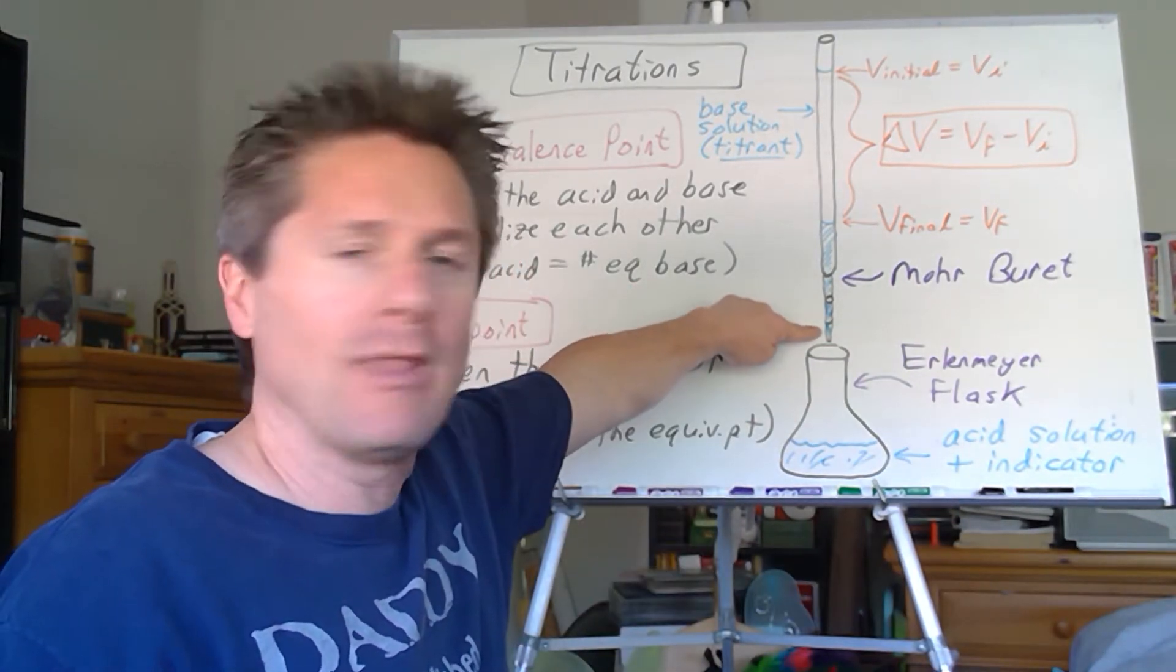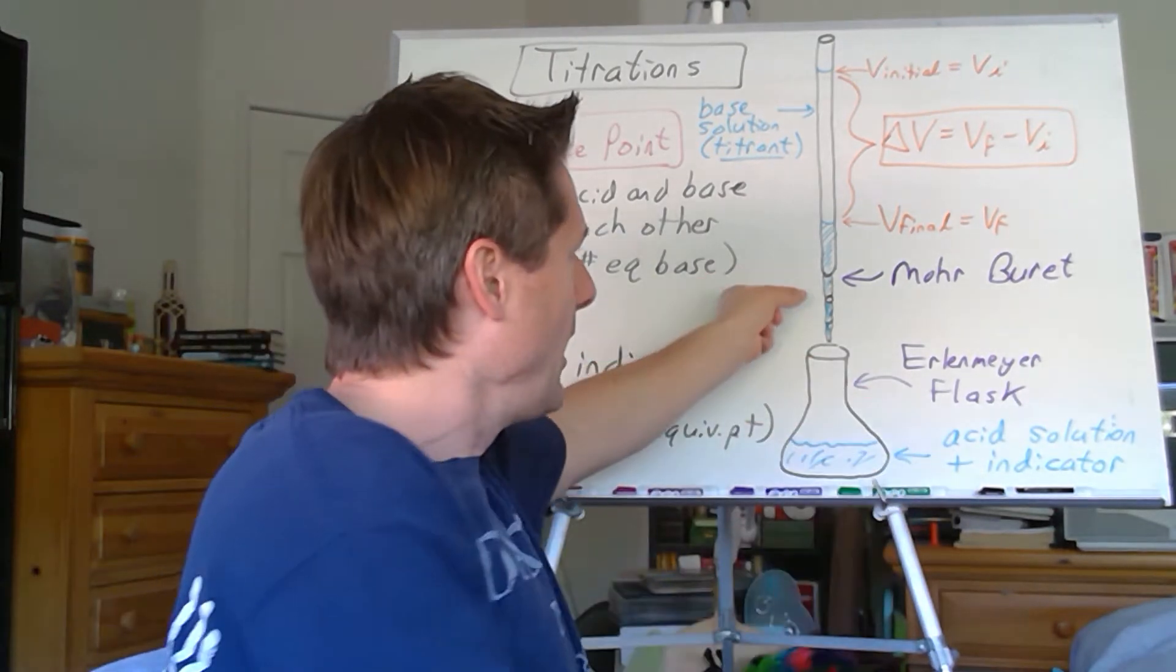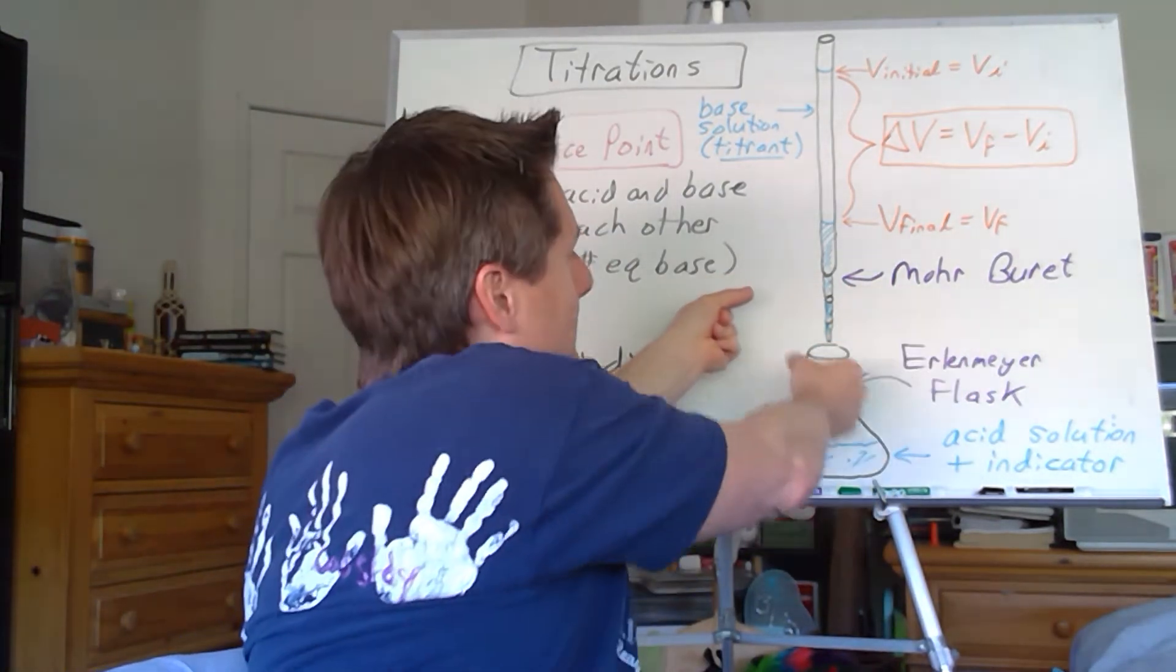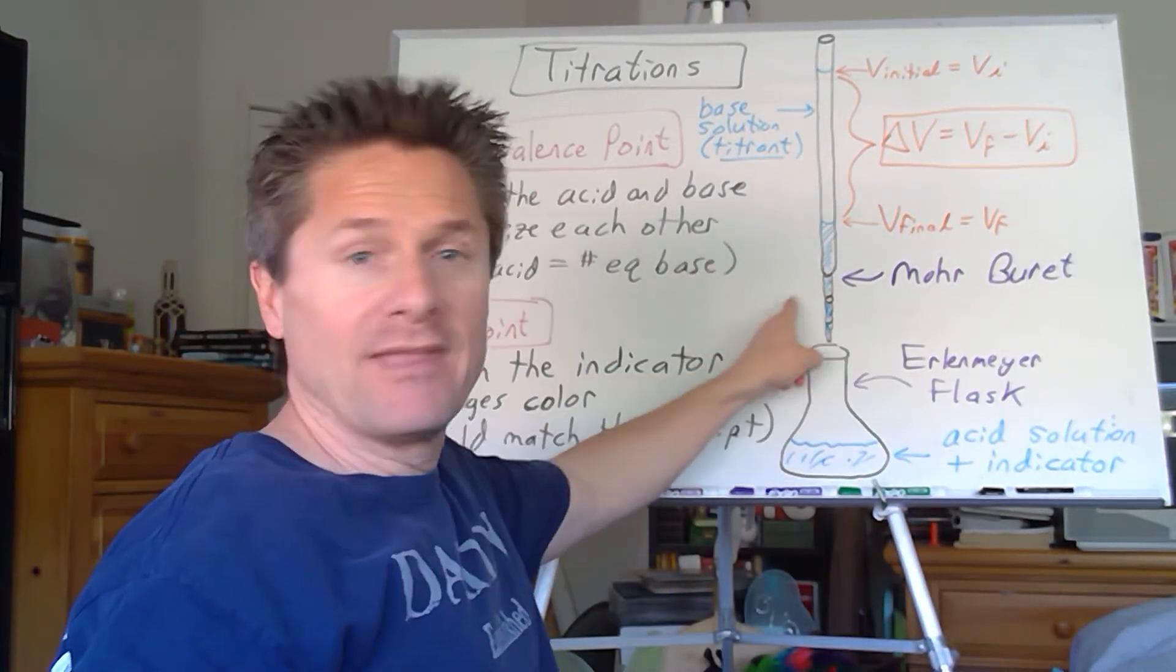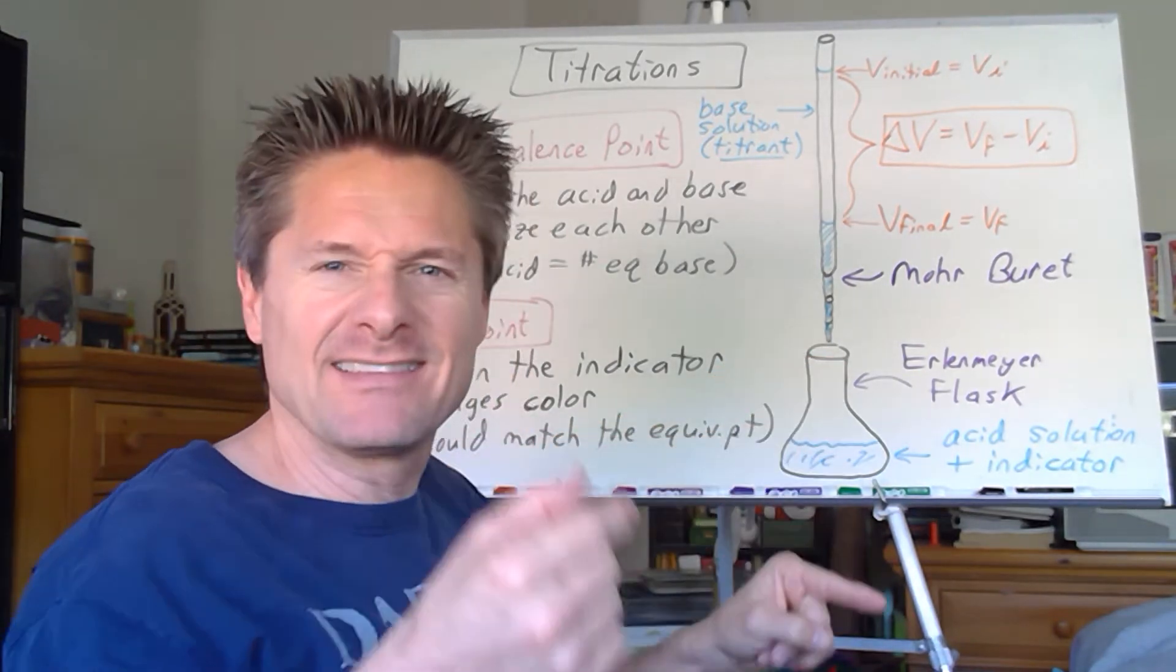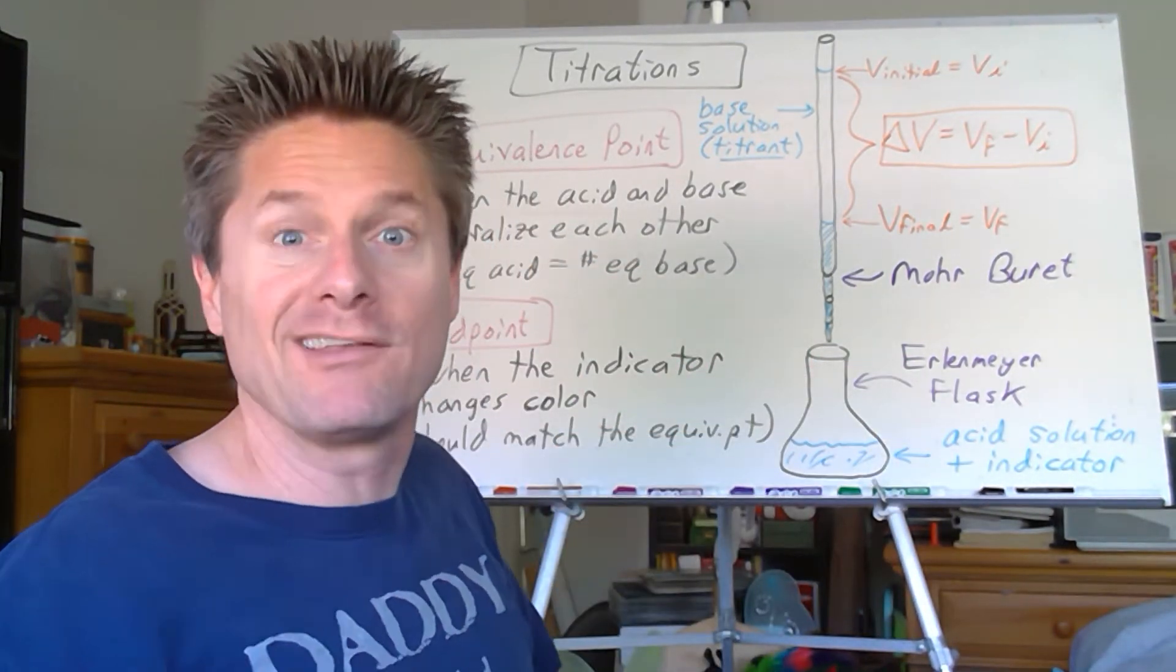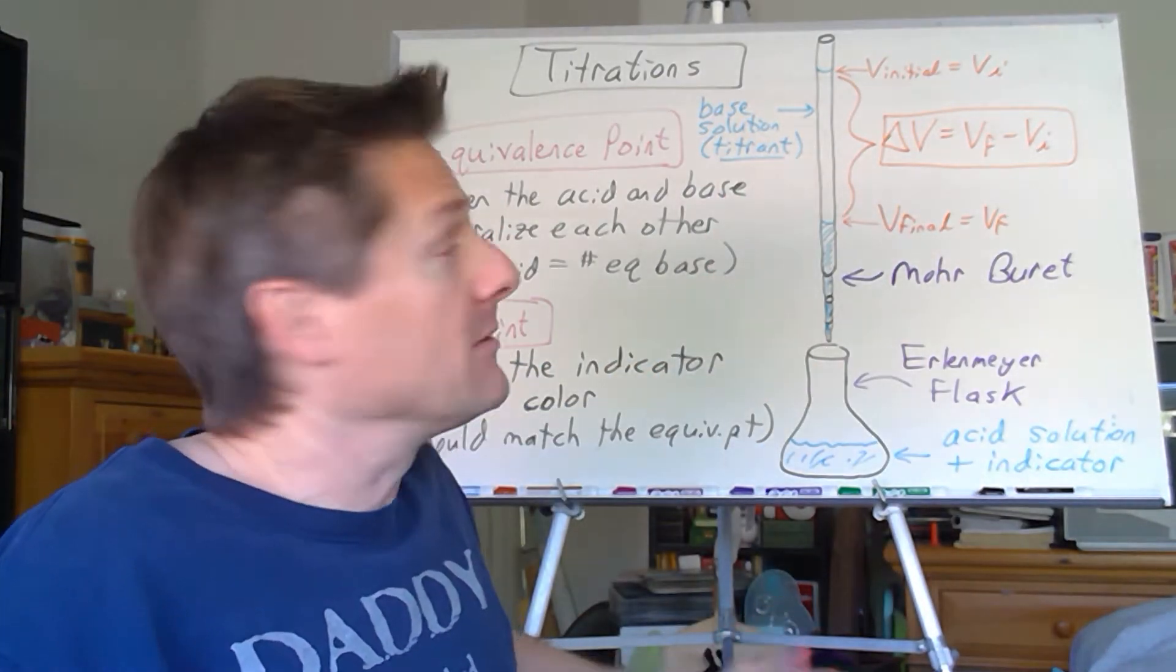And we call that the titrant, what we're adding from the burette into the Erlenmeyer flask. We want to use that Erlenmeyer flask because it has that smaller entrance hole to reduce splashing. So I like to dispense the liquid with my left hand and lift the Erlenmeyer flask up a little bit and swirl it while I'm doing it. I don't want to lose any drops on the outside. You're toast if that happens. But I don't want that clinking on the inside either. So I'll swirl it around.